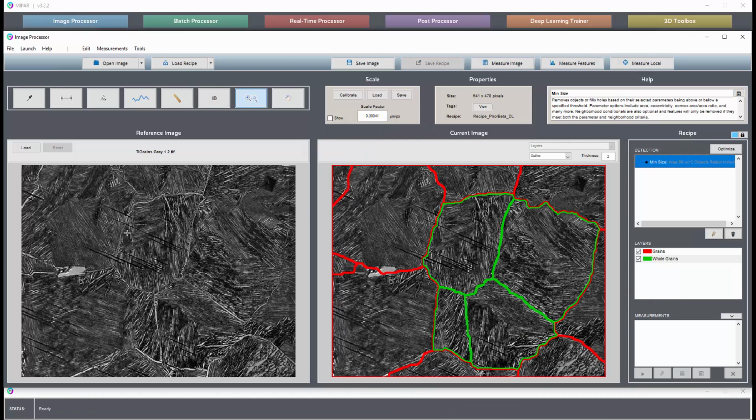And even with these deep scratches and boundaries like this, on an image that was not part of the training set, I would say that this algorithm learned remarkably well how to detect what not too long ago I thought was an impossible problem to automate. So we started the training at the beginning of the webinar, and we had a fairly breakthrough solution done by the end.